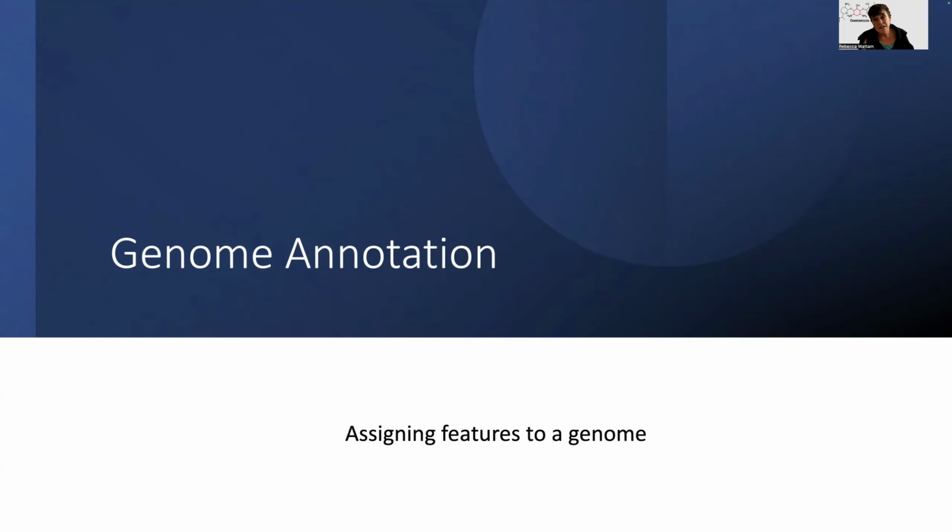But as amazing as assembly is, the most powerful service that we have at BV-BRC, I believe, is genome annotation. That is taking those contigs and putting genes on them so that you can see what the function is, what your organism can do. Now, this is one of the most popular services that we have at BV-BRC. I mean, there have been over 700,000 jobs submitted to this particular service.